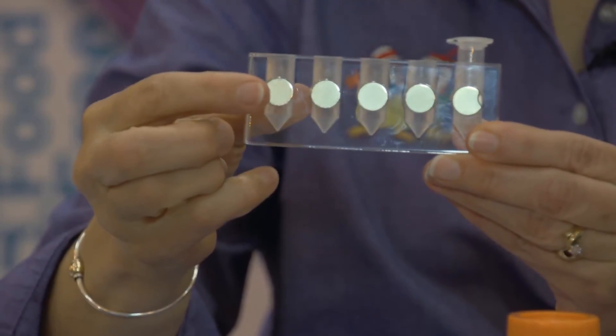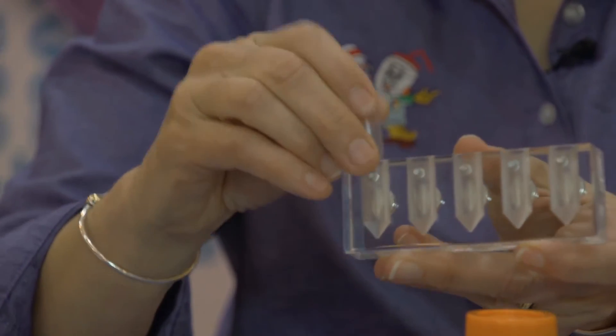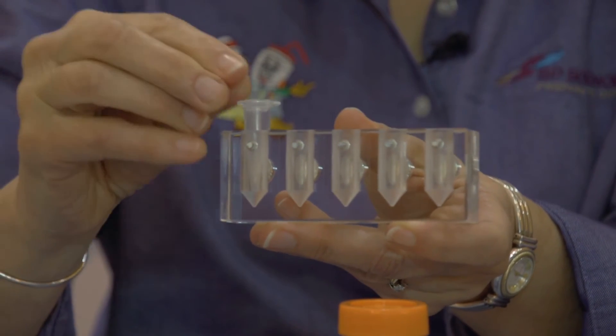The 1.5 and 2 ml rack does not have individual wells, but rather has two sleeves which can be removed, each with five wells. Each one of these wells has a magnet on one side and a spring plunger on the other side. I have flexibility on where my tube is in the well, and hence where my beads will collect on the wall of the tube. Mixing can be achieved simply by turning the tube in the well.